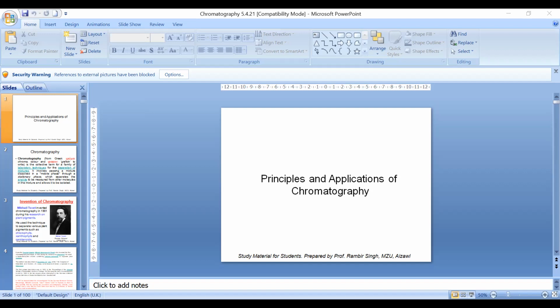So these are three techniques basically. One is centrifugation, another is chromatography, and the third one is electrophoresis. These are the separation techniques. The job of these techniques is that we have to purify a molecule in a single purified form, and that molecule may later be characterized, right?